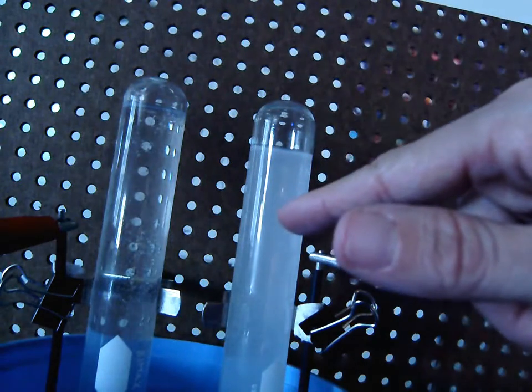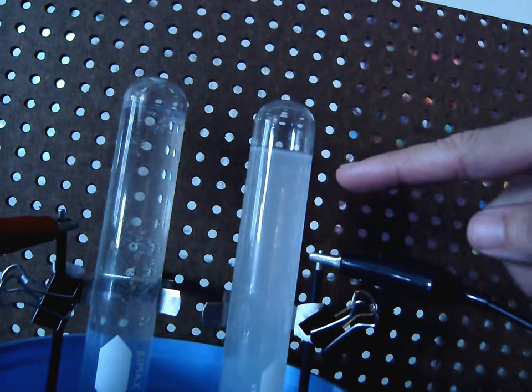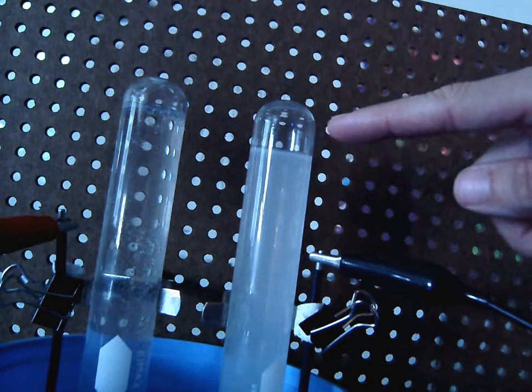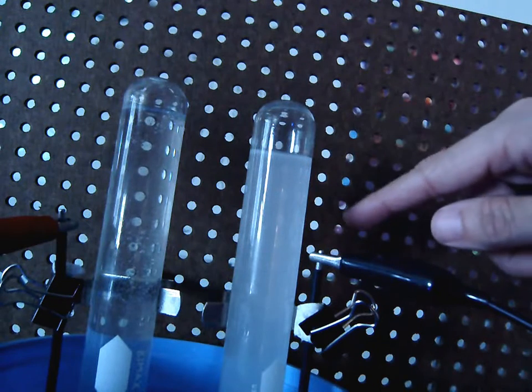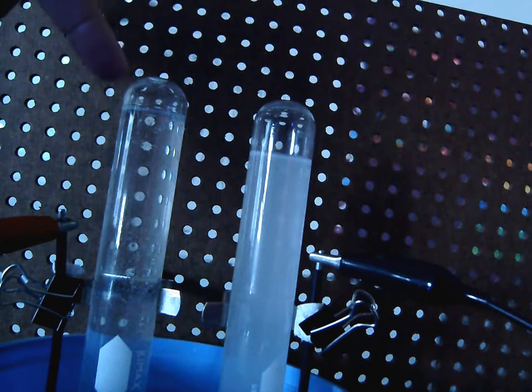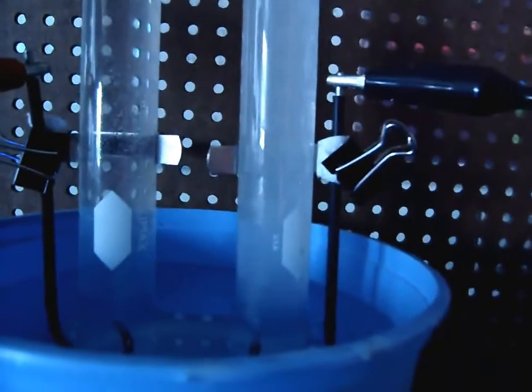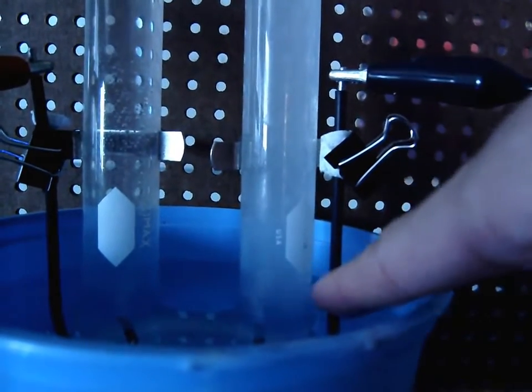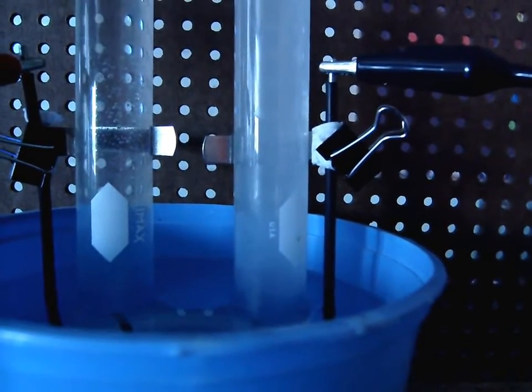Now the reason this one looks white instead of clear like this one is because this one is generating a lot more gas, which makes sense because there's a lot more gas being collected in the test tube. And even as I'm speaking, you can see the water level falling pretty rapidly, especially if you pay attention to the little dots behind it and you have a reference point. You can see that it's dropping at a pretty good pace. The one on this side, while it is collecting gas, is not collecting it quite at the same rate as the one on the right-hand side. And if you look at the electrodes, you can see the gas coming off this one really fast. You can see the gas coming off this one too, just not nearly at the same pace.